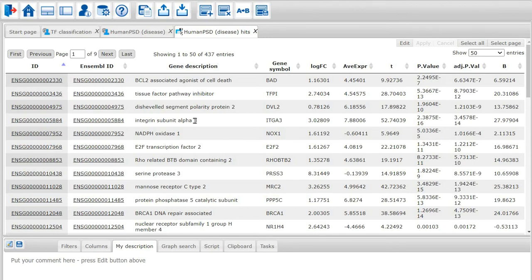I plan to further analyze this interesting list of genes to identify regulatory transcription factors as well as the master regulators in signaling networks. My aim is to suggest master molecules involved in regulation of gene expression in triple negative breast cancer cells. This will come in the next part.